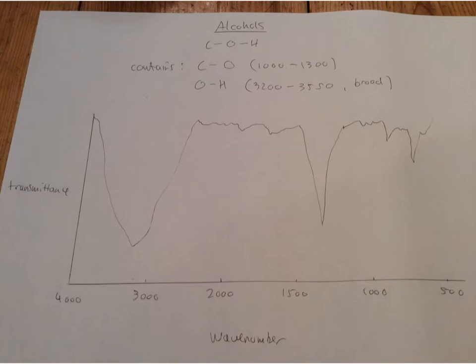Notice with the scale on the bottom as well how it works in reverse. Also, between 2000 and 4000 wave number, it crunches down slightly. It gets a little bit squished together. The axes are transmittance and wave number.